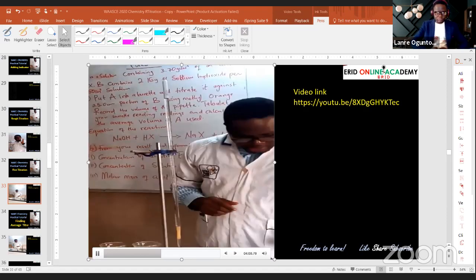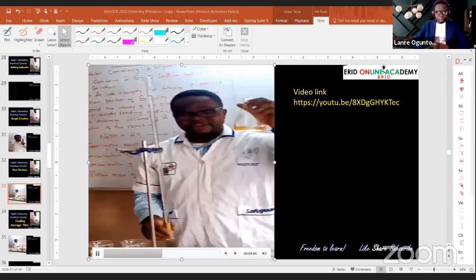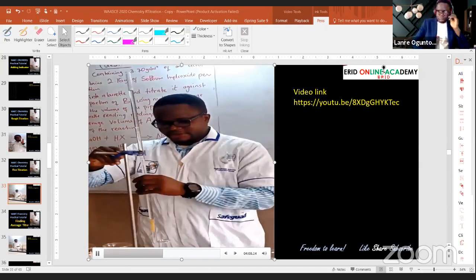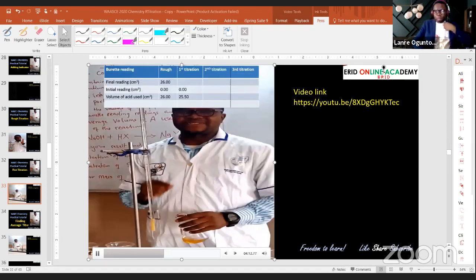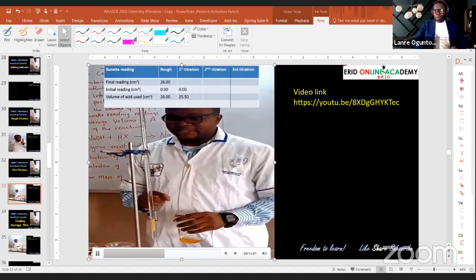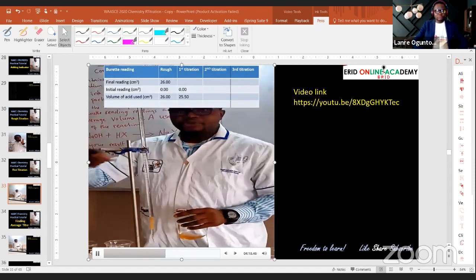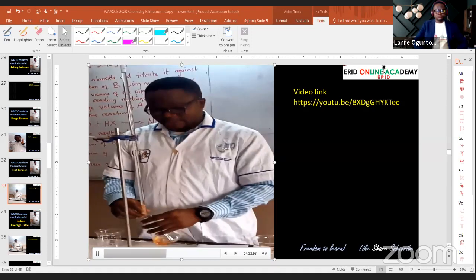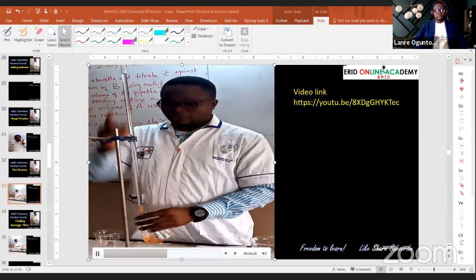Good. So now let's take this conical flask, my first titer. The reason why we call it first titer is that it's your first most accurate titer. I put my hands here, then your eye now focuses on this, no longer this.